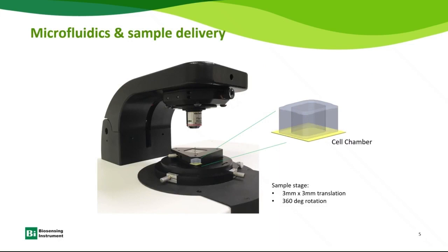This is what the optical system and the chip well look like in a real system. The optical microscope looks from the top of the chip. The polymer well sits on top of the gold chip, and the gold chip can be functionalized chemically for culturing different cell lines. Most commonly, collagen, PLL, PDL, and so on are used.